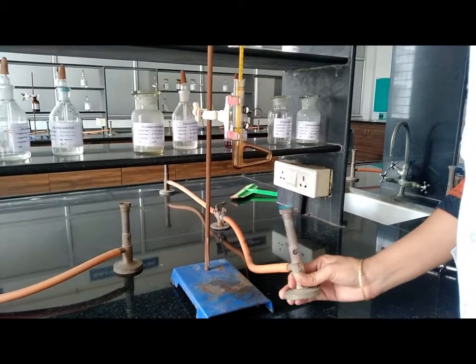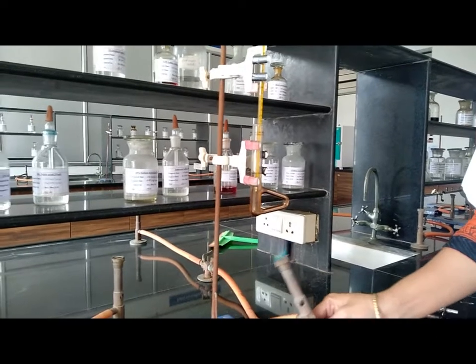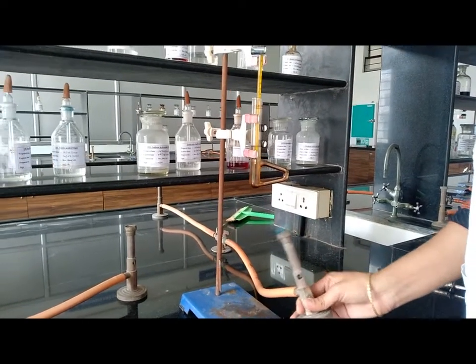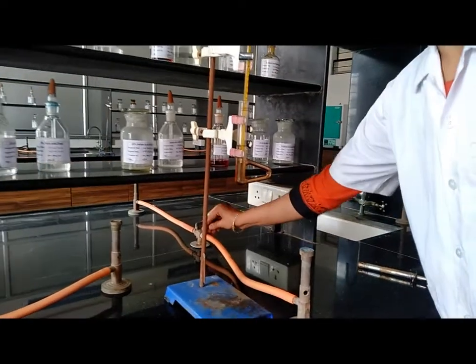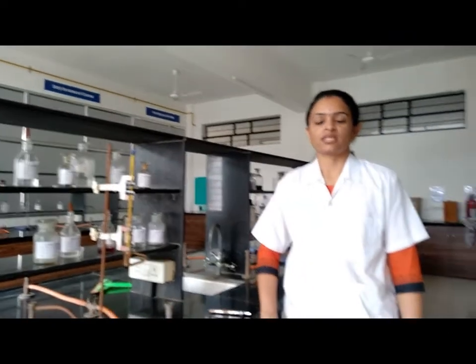Now the solid starts converting into liquid form. When the solid has totally converted into liquid, at that time stop the heating and immediately record the melting point. Almost all the solid particles get converted into liquid form. The melting point is 142 degrees Celsius. That is the melting point for aspirin, acetyl salicylic acid, 142 degrees Celsius.